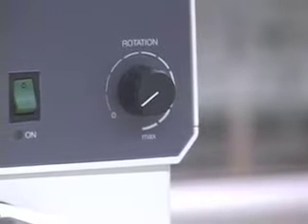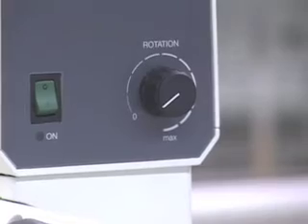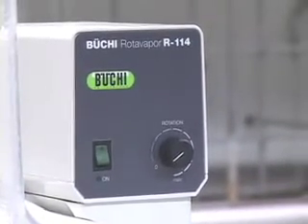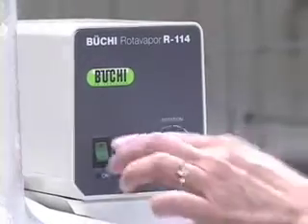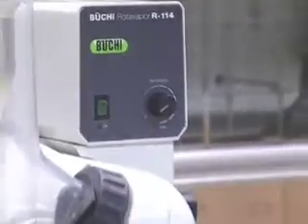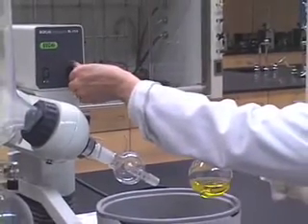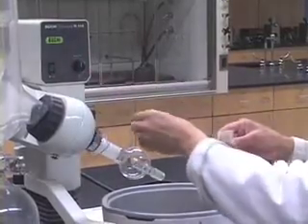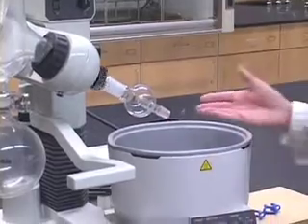You are going to evaporate off the solvent while the round bottom flask in which you have the solution will be continuously rotated by the system. For example, if I turn the switch on here, I am not attaching this yet, but I want to show you how the rotation works. I am turning the dial on and you notice that this started to rotate.